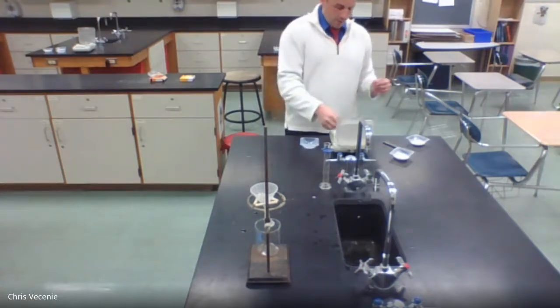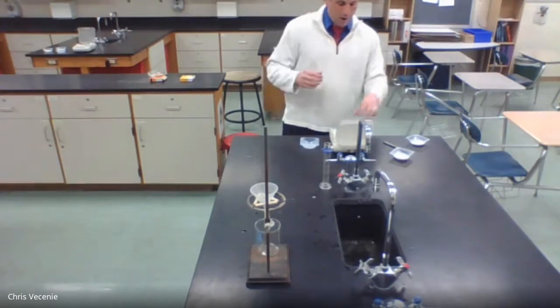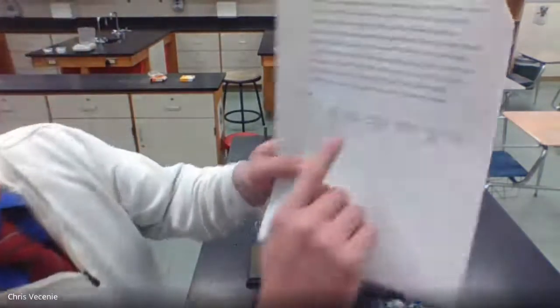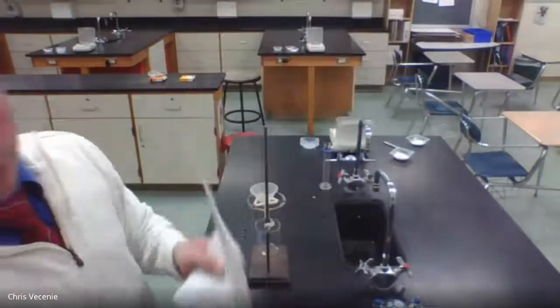All right, so I zero out my balance. I put on my filter paper. All right, the filter paper weighs 0.50 grams. So right here for your massive filter paper, that's 0.50 grams.